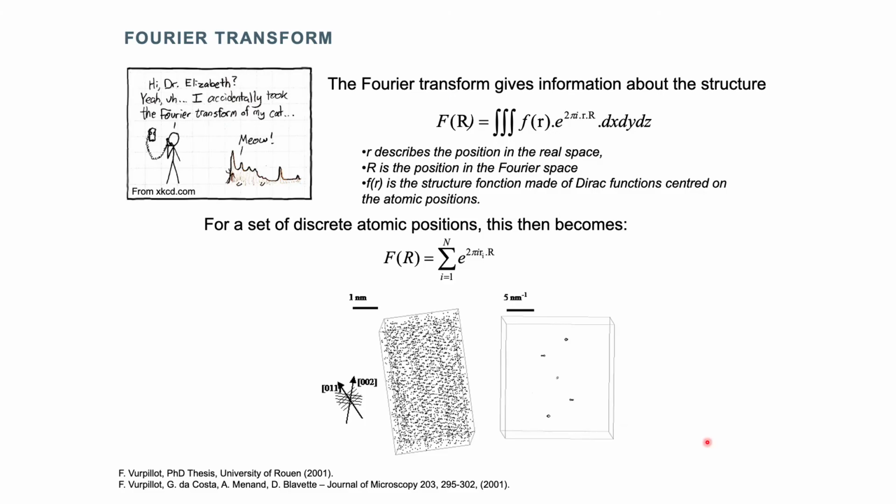So there are a few approaches. One that's quite famous is the Fourier transform. It's typically what is happening when you do diffraction, either with X-rays or electrons, same idea. So we can do the same thing and calculate this Fourier transform directly by summing all of these functions based on the position. So you have to grid the reciprocal space, and then you take all of the atomic positions in the real space and then calculate the Fourier transform and see where you start adding up some of these higher intensities in the reciprocal space.